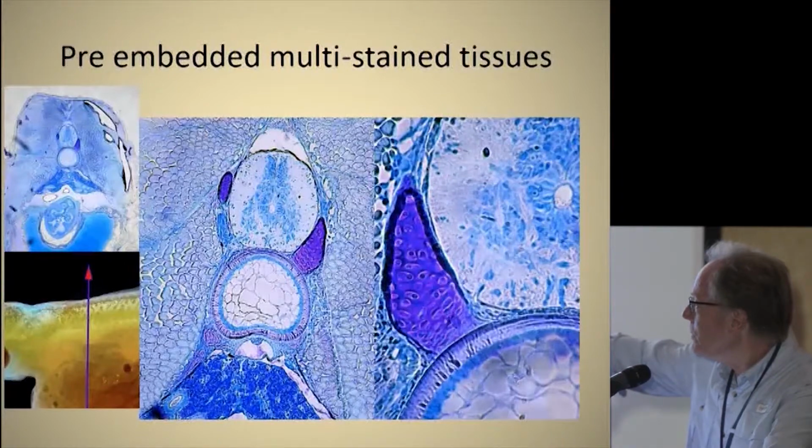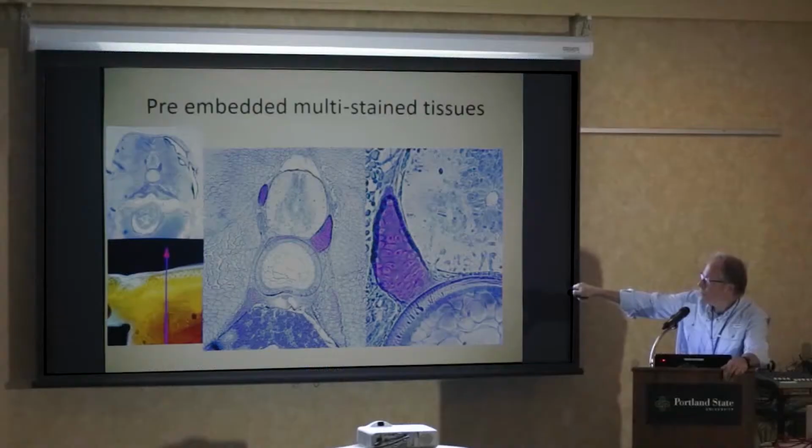So here is the gut tube. This would be yolk; I'm not really concerned with that. We will be in the Seahorse pictures. The developing notochord that we already talked about, and the neural tube, just for your orientation. That doesn't really show a great deal of distinction.